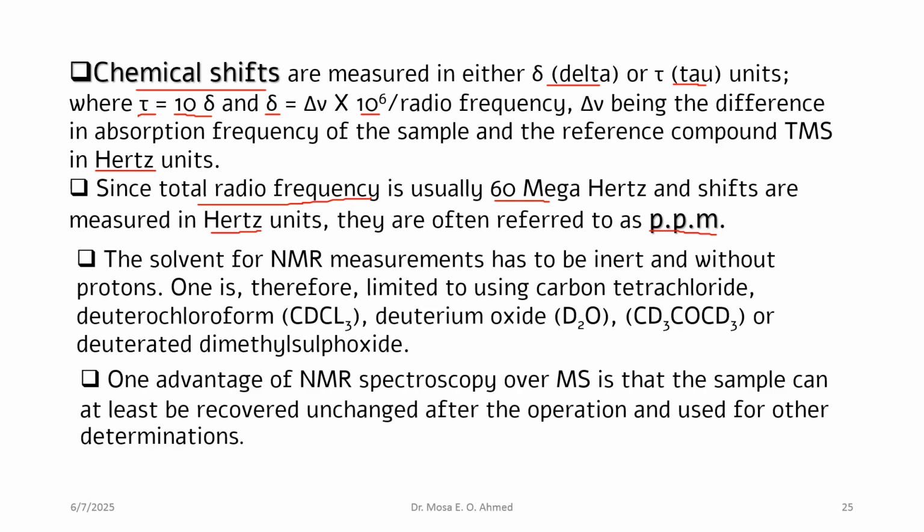Another important instrumentation aspect for NMR spectroscopy is the use of an inert solvent.